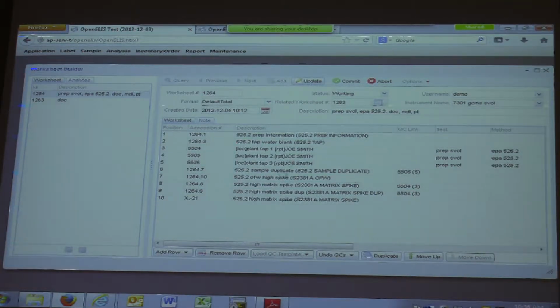When we were first building this one, I don't know if anybody noticed, I think we should mention this index number here, this X-21. That's part of the same fix. Matt says it's part of the same fix. What happens is you get a number here that doesn't make sense. X is just a temporary placeholder, but when you commit, it orders properly.